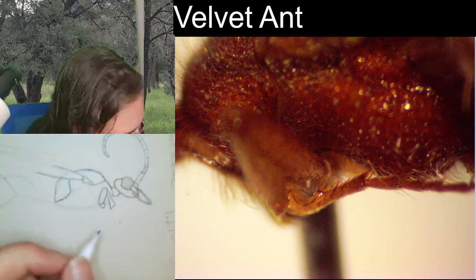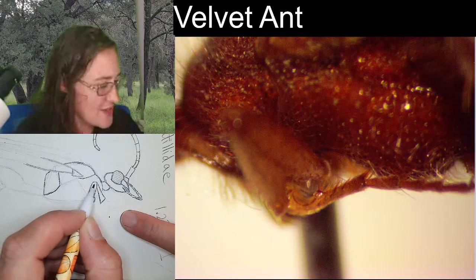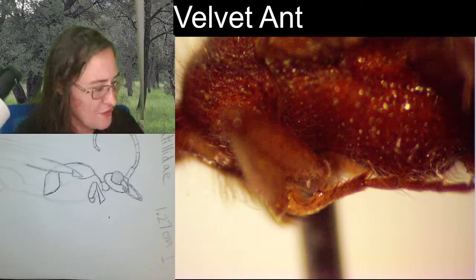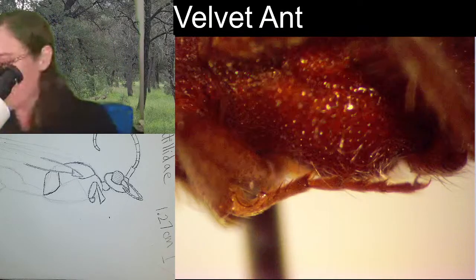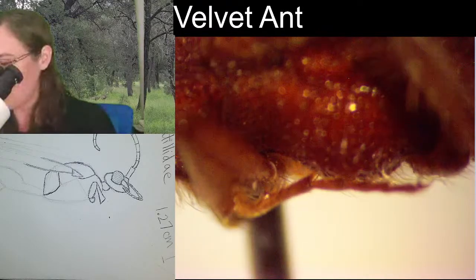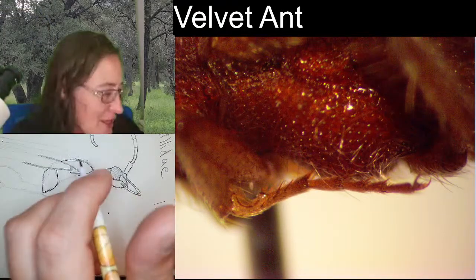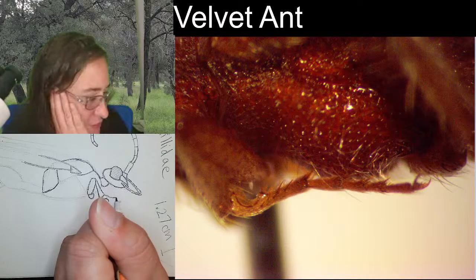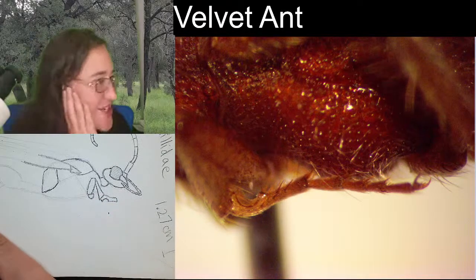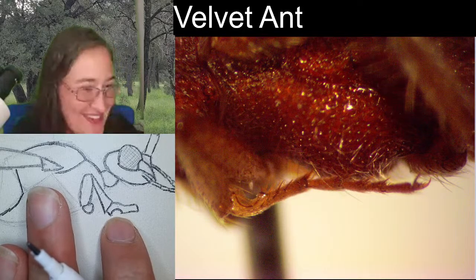Sometimes it takes a little bit to reshape these guys. All right, so we've got the coxa coming up, the coxa down here, femur, tibia, and then we have all of these tarsal segments. Let's see, we have 1, 2, 3, 4, 5 tarsal segments, but the first one is wonky. I don't know how I feel about this first segment. So it's kind of shaped like a car without a wheel. That's what it reminds me of.